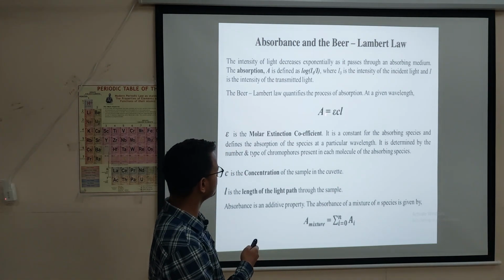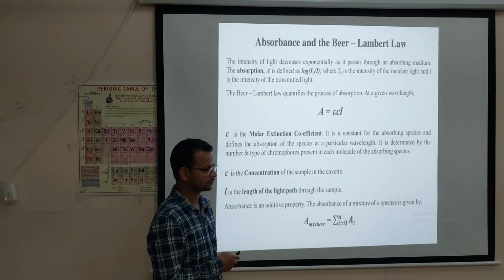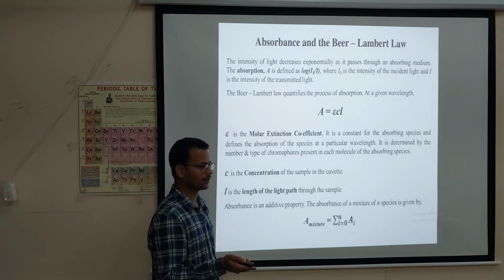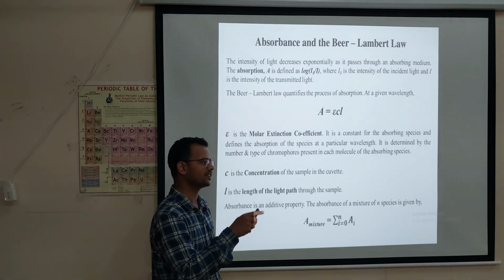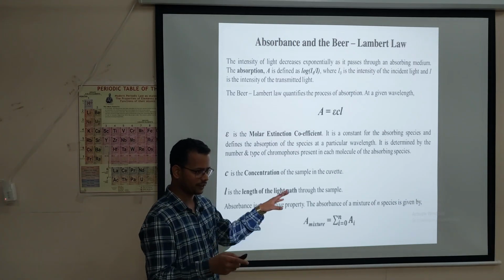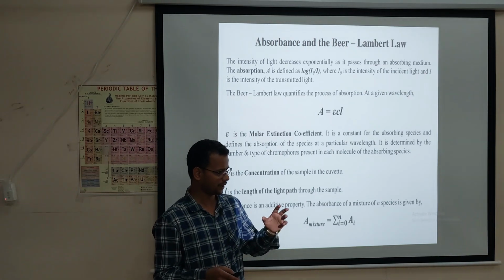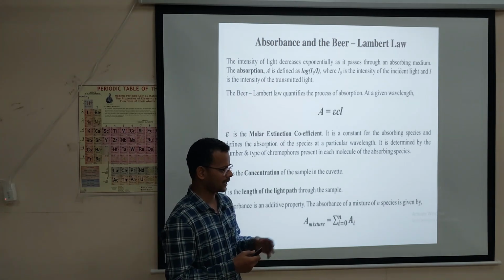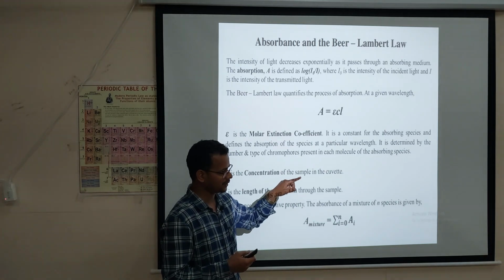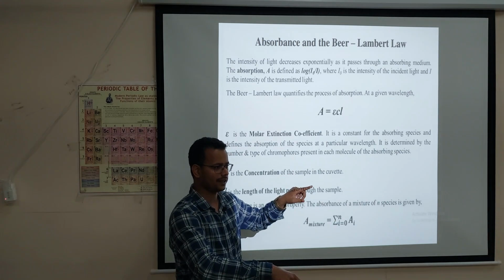Here A is absorbance, na? Yes. During our experiment, I will tell you how to calculate epsilon. I have not provided everything here. During the reaction, when we do our quantity measurement of any type of material, I will explain how we can calculate epsilon there, and after that calculation, that epsilon will be constant for the related experiments.